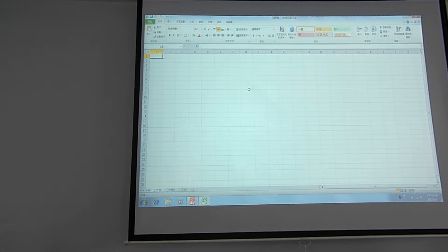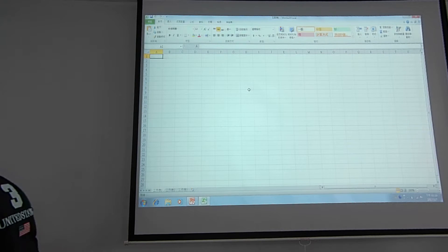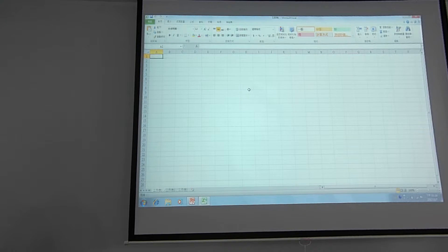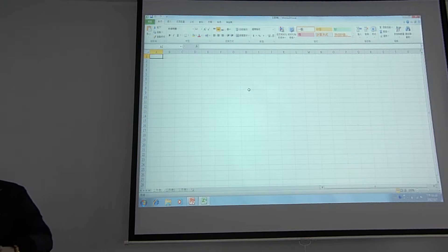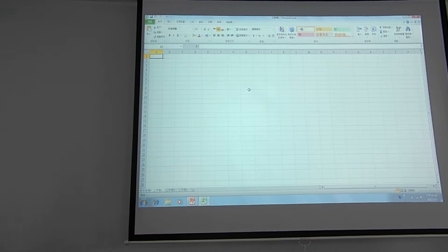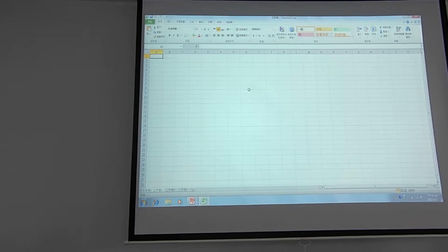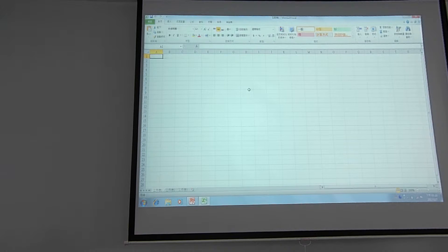There is an extra page in the Excel file already set up. The next page here is an example of the file we will be working on.